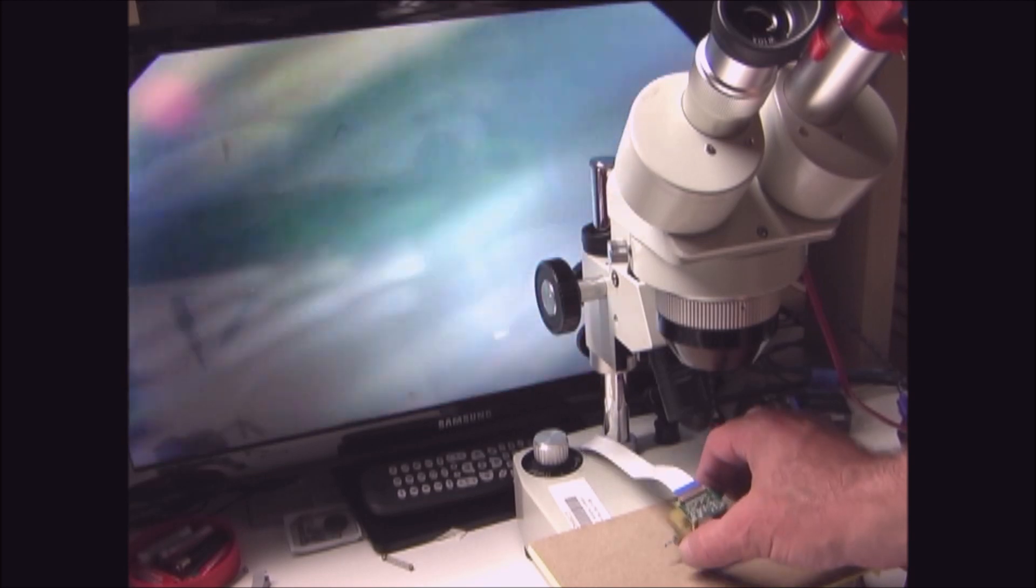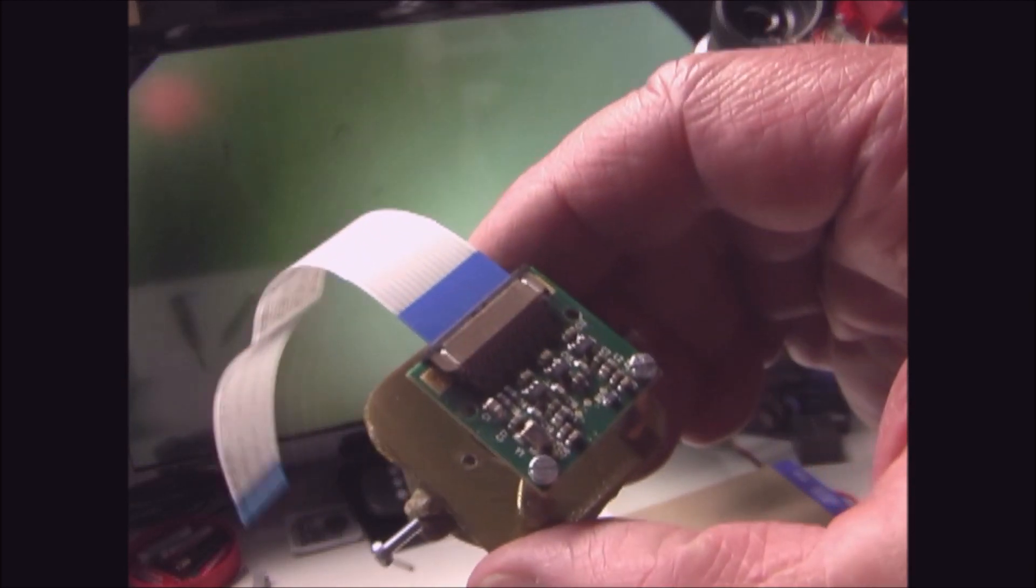What we're looking at here is the back of a Raspberry Pi camera at 30 power.